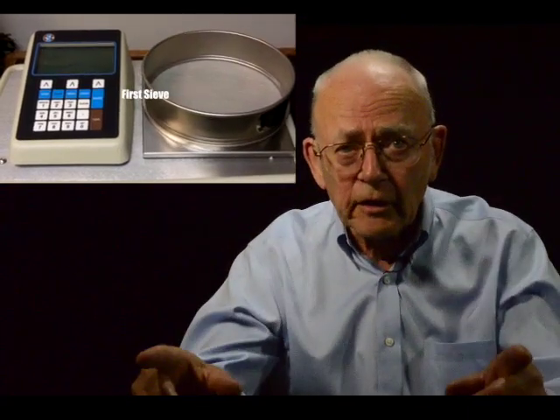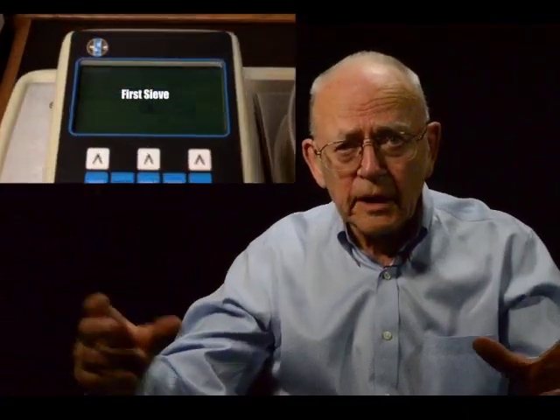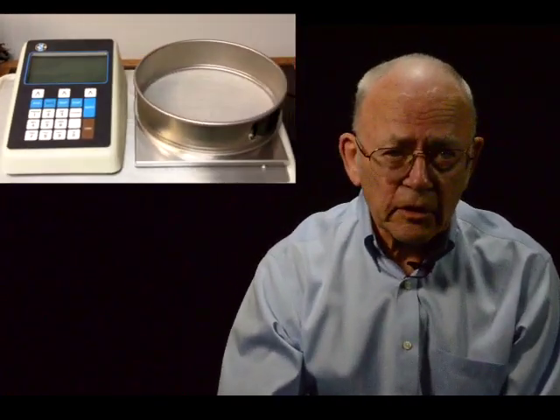When the shaking part of a test is finished, the top sieve is placed on the analyzer, followed by each of the other sieves. Each sieve is on the analyzer for about four seconds. For example, a complete analysis of a six-sieve test, including the printout, can be done in less than one minute. Watch us do it.